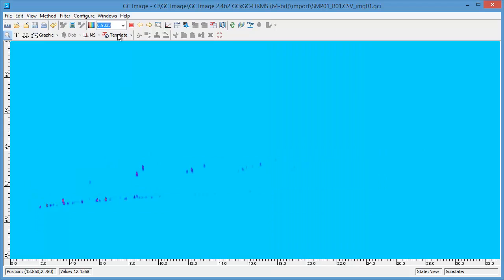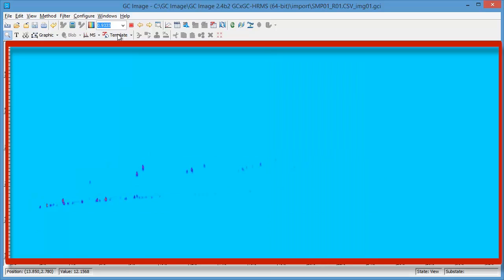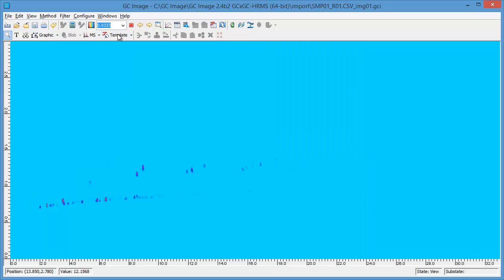For visualization, the detector data of the 2D chromatogram is used as pixel values to create a digital image shown in the image viewport. The pixels are colorized so that the color of each pixel indicates the value. 2D chromatograms often have a large dynamic range and a fine numeric precision, so it is important that the color scale is used effectively to signify values. If the value mapping for colorization is not appropriate, some or even all of the chromatographic peaks may not be visible.